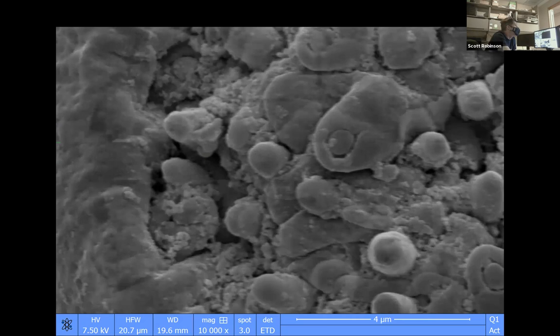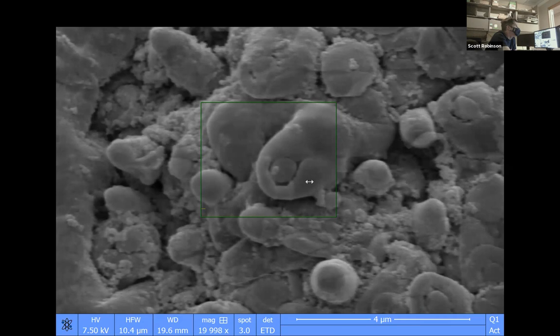And we can go a little bit higher and we can see where it's been sticking itself in. I wanted to make a comment about the grass grain you mentioned. It looks like there's a tiny white line that constantly starts coming down. I'm assuming that's showing where the current raster is. You guys can kind of see that on the left side of the screen.